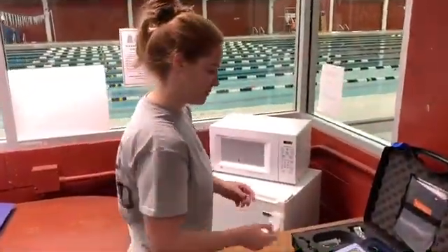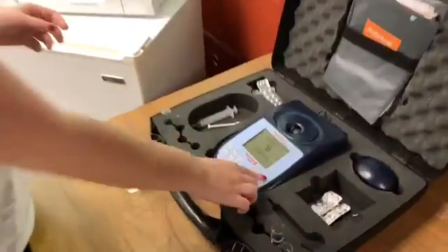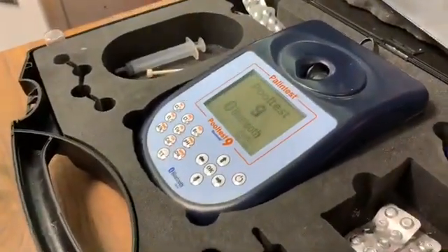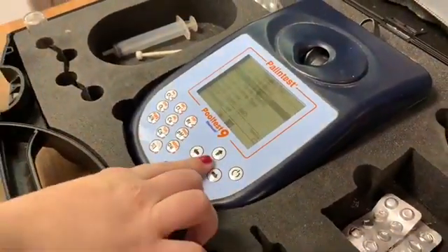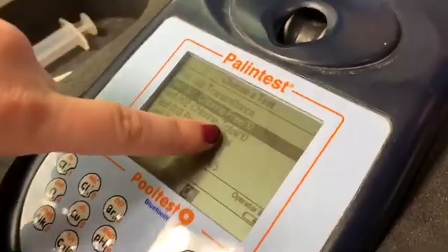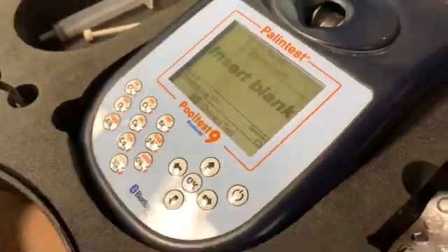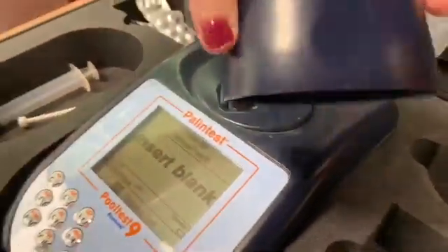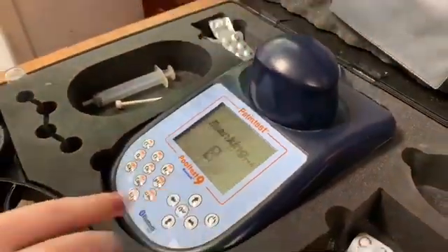Now that we have our tablets so that we can begin to test in the pool, you will press power. Wait for it to turn on. Go to chlorine — make sure it's the free and not the total. You will then insert a blank tube, put the cover on top, and press OK.